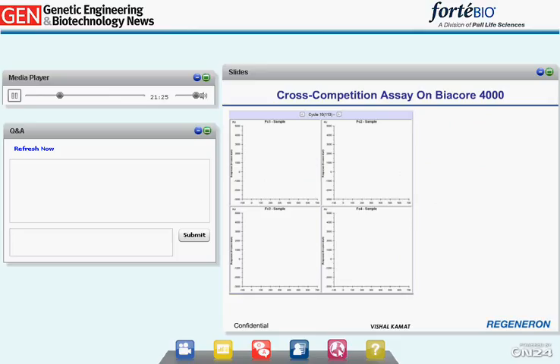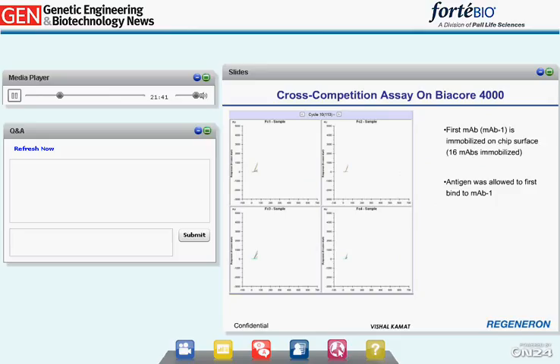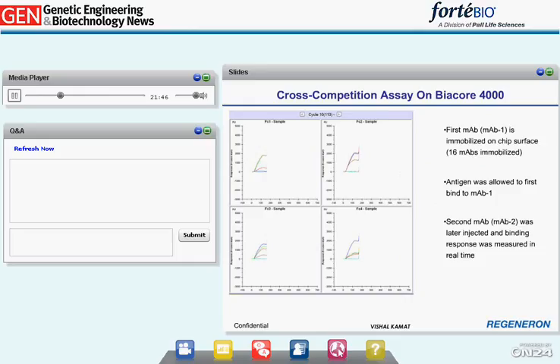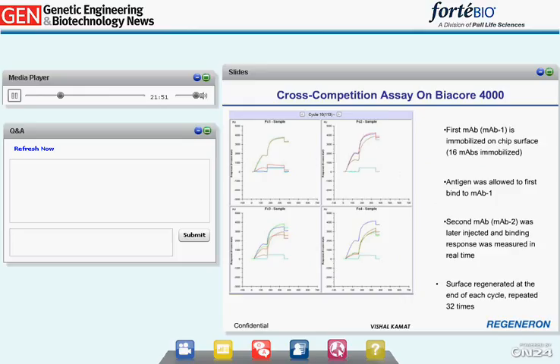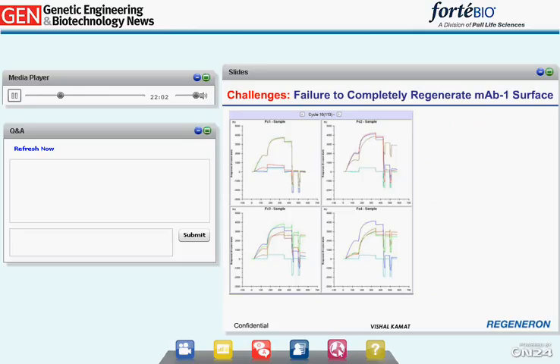Here I present an example of using the Biacore 4000 for a 32-by-32 cross-competition assay at Regeneron. We used the classical sandwich assay format, with 16 different antibodies already immobilized on the sensor chip. Antigen was injected over the MAb1 surface, followed by injection of MAb2. At the end of each cycle, the surface was regenerated to remove the captured antigen from the MAb1 surface, and the entire cycle was repeated 32 times. However, while running this assay, we encountered challenges with regeneration of the antigen from the MAb1 surface.